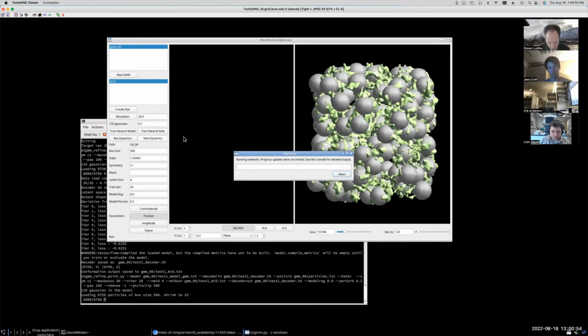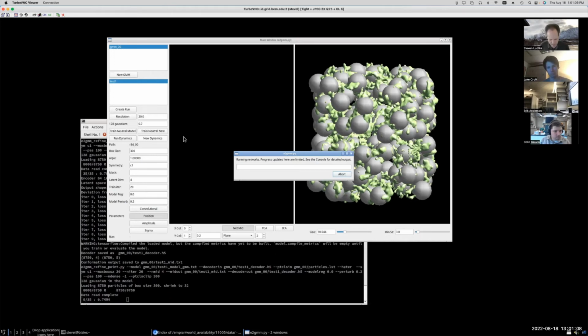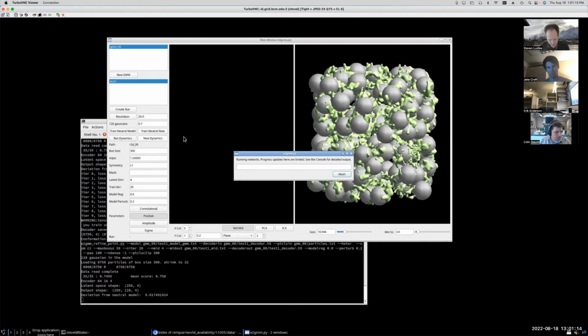What we just saw there was a complete failure case where it really just didn't find anything at all. If we don't get to a success this time, I'll switch to a folder where I did a simulation previously, and we can quickly look at that so you can see what it's supposed to look like. But hopefully it'll run right this time.